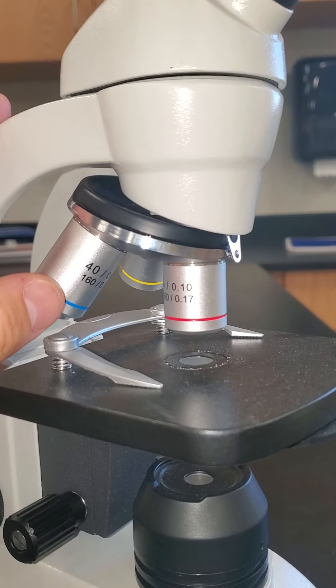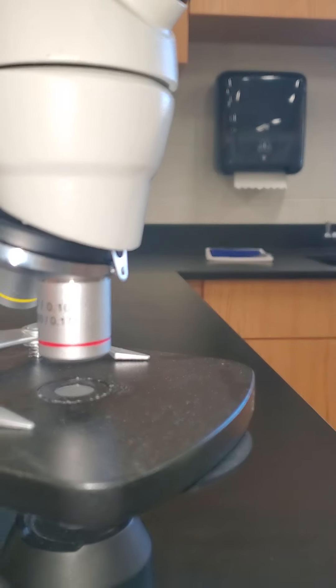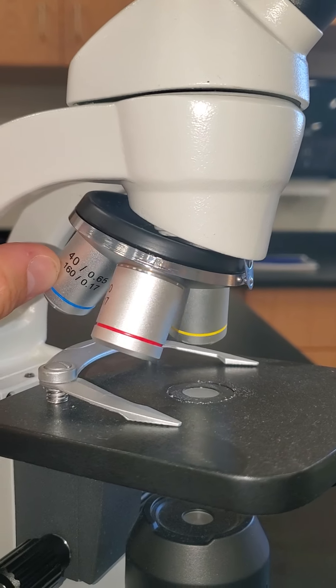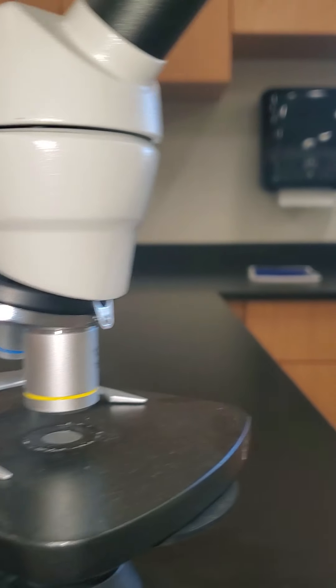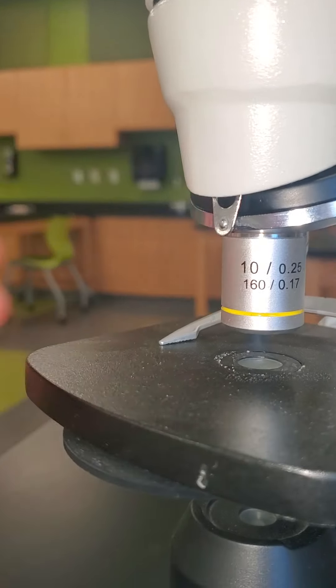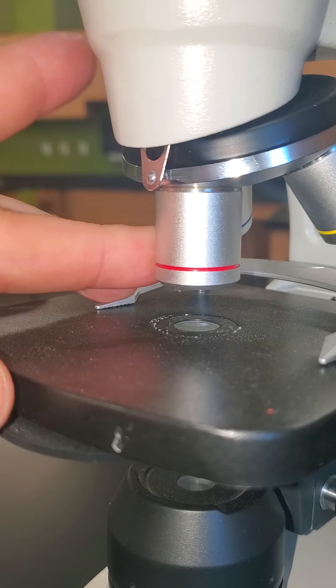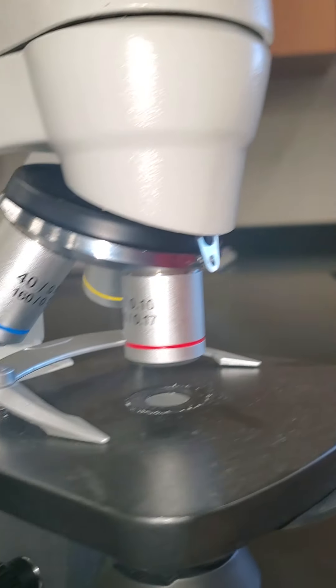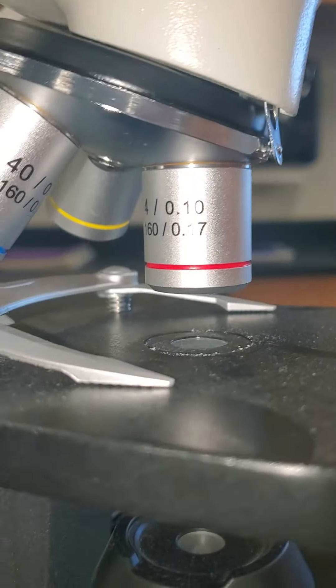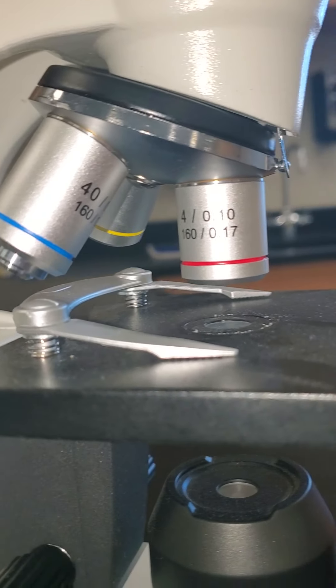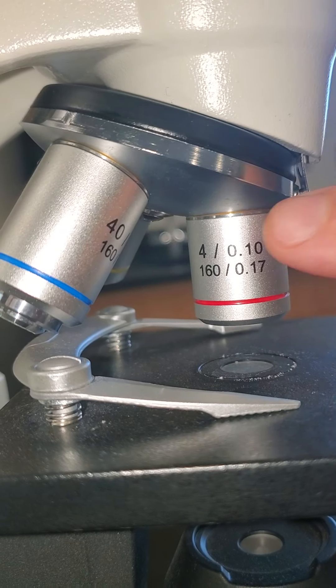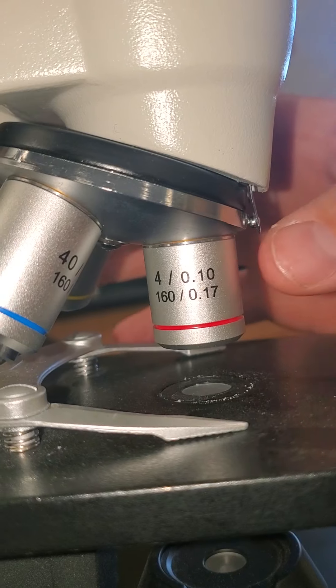It is three lenses with different powers on a rotating wheel. At certain angles you can actually see that it shows the magnifying power of these lenses. Red being the least magnified, four times magnification.